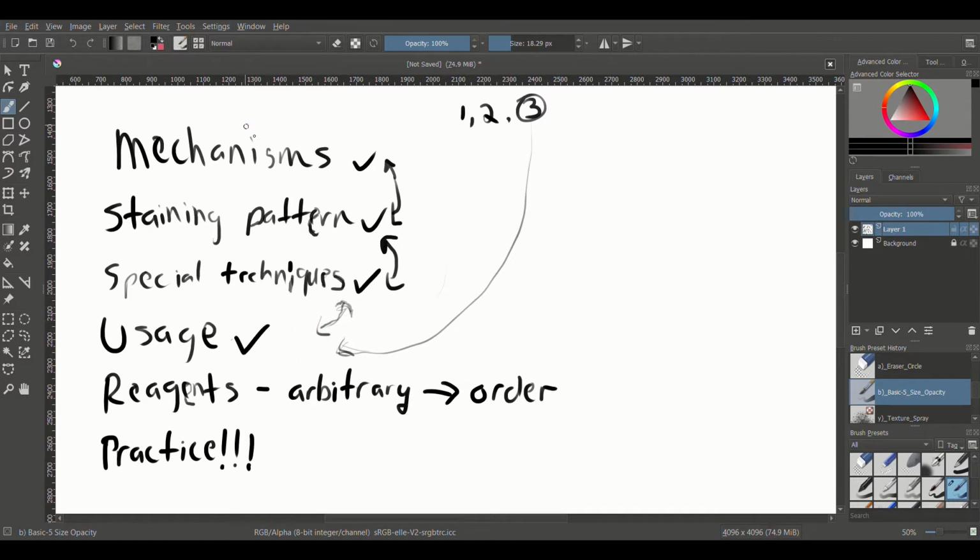So once you get through all this, then honestly you get to the hard part, which is reagents. Reagents can be really difficult to learn, because when you learn them initially they look arbitrary. I mean, when I started histo school, I had a background in chemistry, and still a lot of our reagents were pretty foreign to me, pretty arbitrary, because there's a lot of chemicals that you can work with, and you most likely have not encountered all of them by the time you get into school.